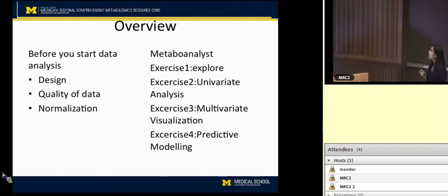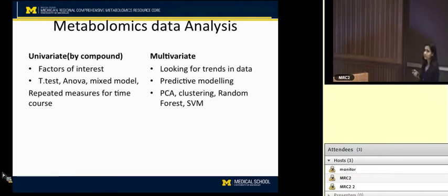And then in exercise 3, we'll see multivariate analysis and some visualization. And then if we have time left, we'll go for the predictive modeling tools that we have in MetaboAnalyst, some random forest and PLS-DA.